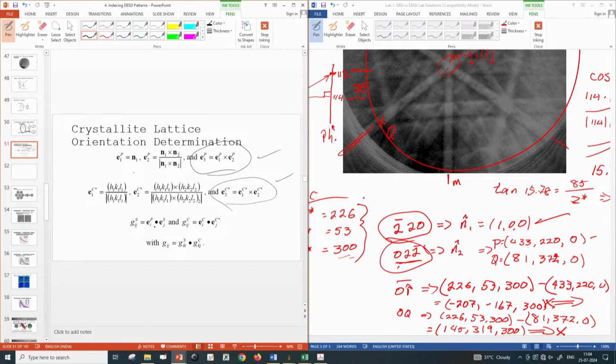And then we have only this difference between the specimen and the phosphor screen, which is a 20-degree rotation, which we can do the direction cosine matrix immediately. And then we have everything, we can calculate the direction cosine matrix. It's messy to do by hand, right? The computer does this 8,000 times a second or whatever, and so we don't need to do it. But to do it by hand, a little messy, but it's nice to know exactly what's going on with the calculation. All right, so since this is the extra credit problem, I'm going to leave it for you.